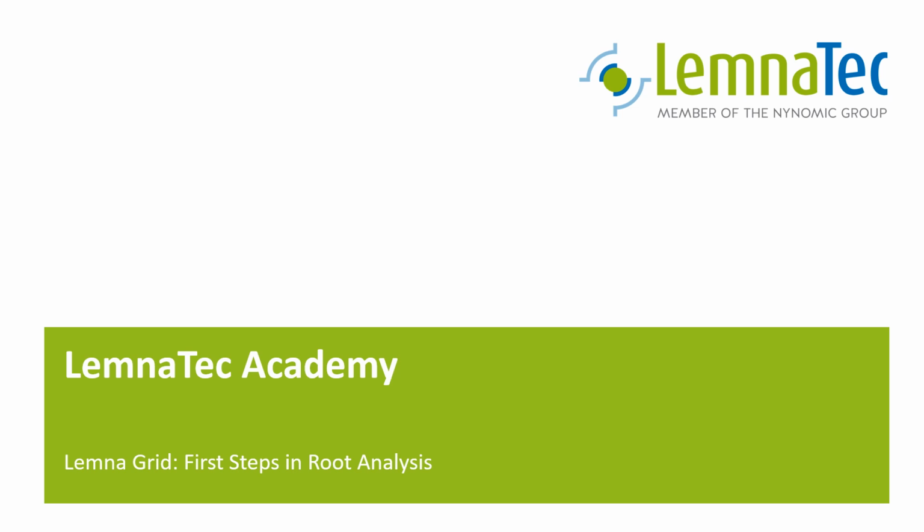I strongly recommend this. Segmentation of root systems often depends not only on color, but on local context. The same absolute color at one point in an image might just be a piece of soil or a discoloration in the other, while the same color at a different spot may indicate root hair or an old root. These kinds of contexts can be handled by machine learning better than with other segmentation techniques.